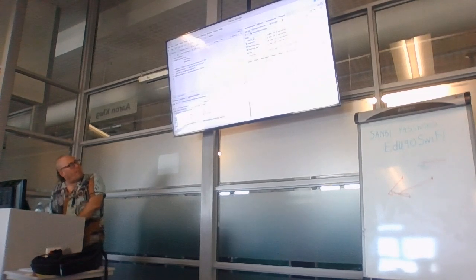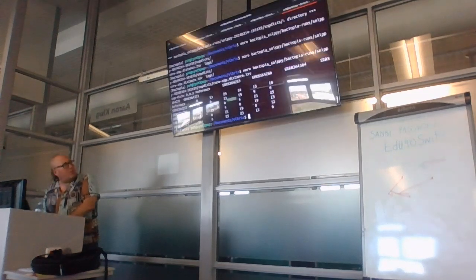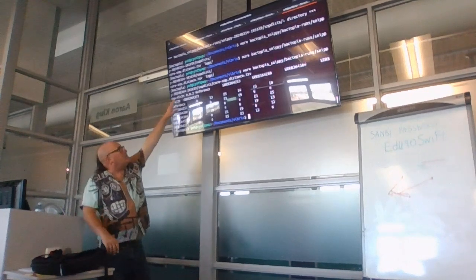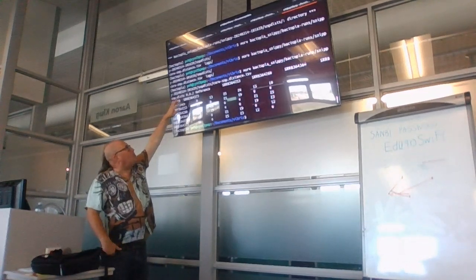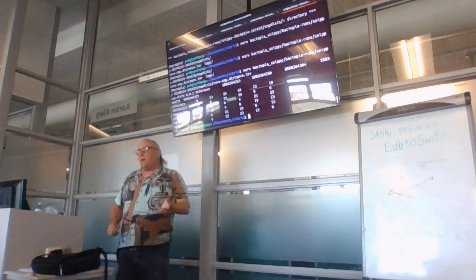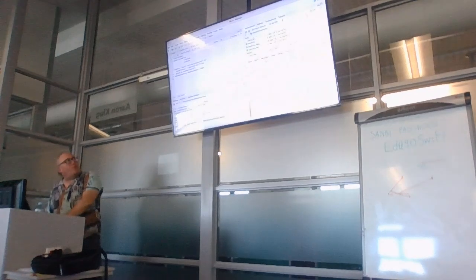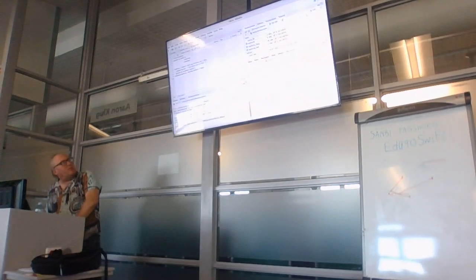Okay. So just remembering what this thing looks like on the terminal, the first column is just the name of the software, snpdist 0.8.2, which is not what I want. I wanted to rename that column, but then I wanted to turn the first column into the row names. So I don't actually need this, I just wanted to make a matrix with the first column as the row name. So the matrix looks like this.